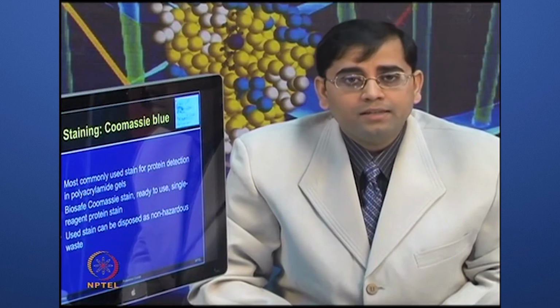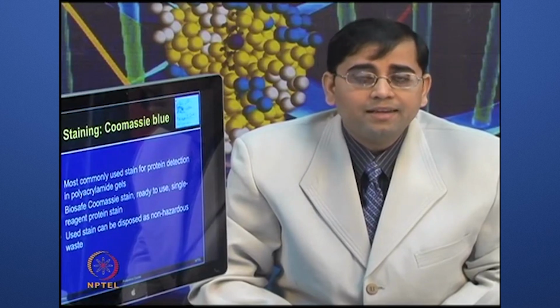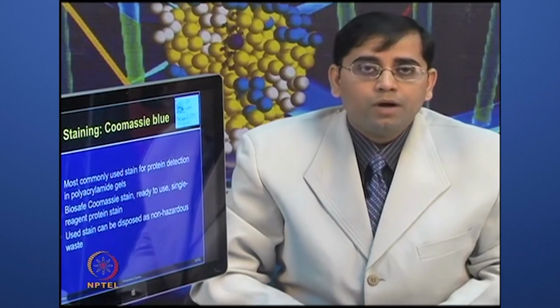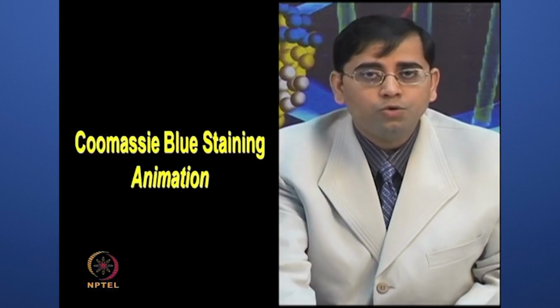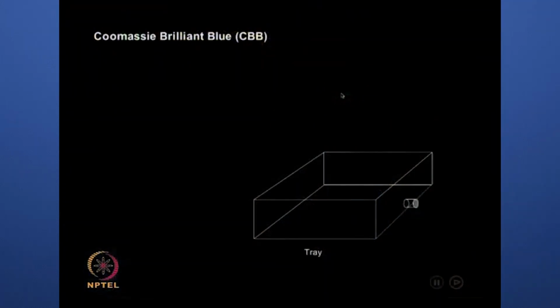The BioSafe Coomassie is also a ready to use stain and a single reagent protein stain. So, I will show you one animation of how to perform the Coomassie blue staining. In this animation, I will show you how the staining can be performed by using Coomassie brilliant blue stain.